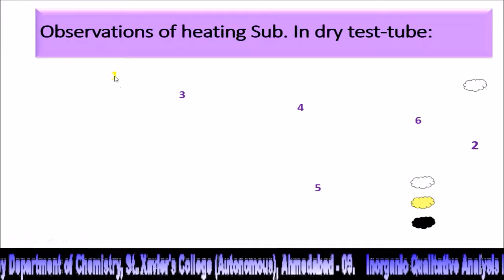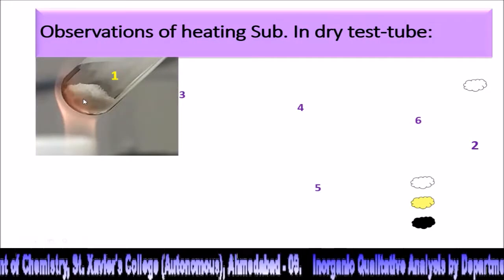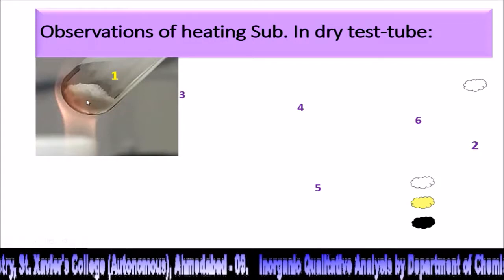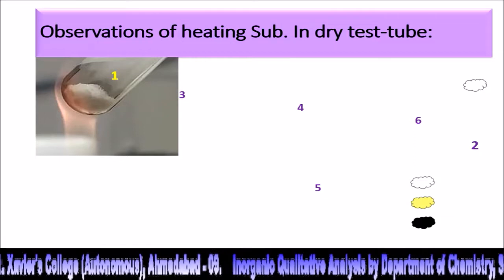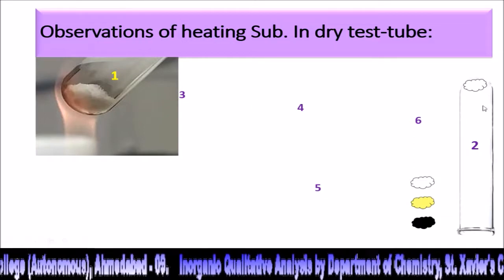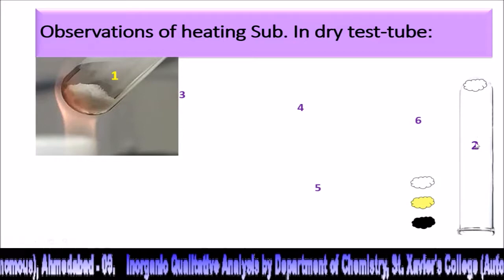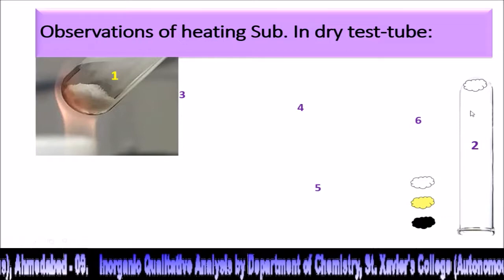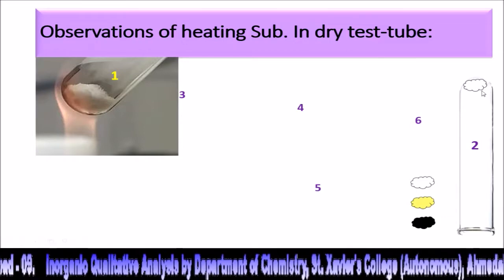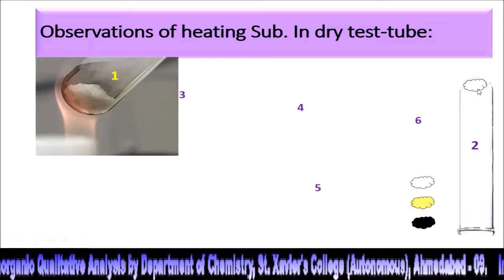Number 1, for the observation, when you are going to heat the substance, you need to know whether the substance melts or not. Crystalline substance will melt, amorphous substance won't. And when the substance melts and you invert the test tube, it will stick to the bottom. Then we can say that the substance does melt. And if the substance won't stick to the bottom, you can say that the substance does not melt. So that way you can take your observation number 1.